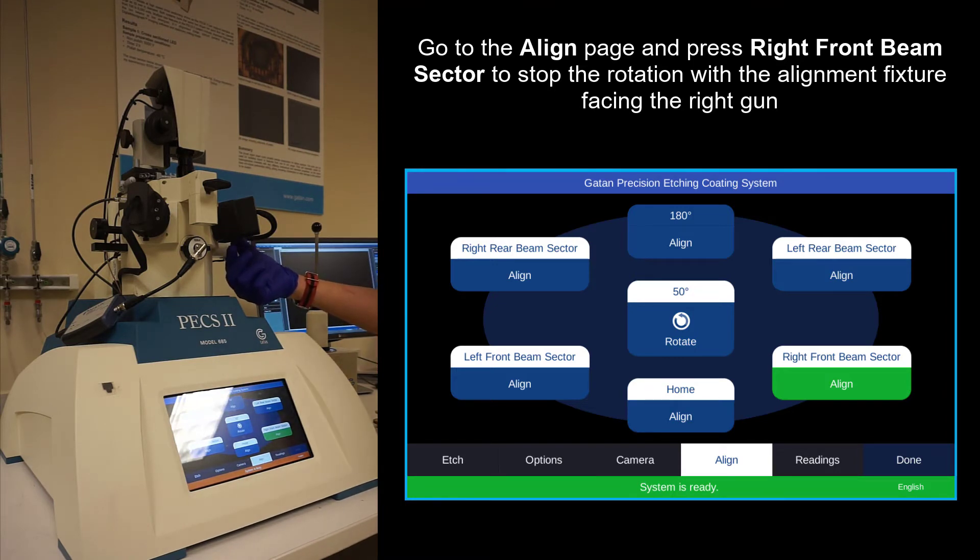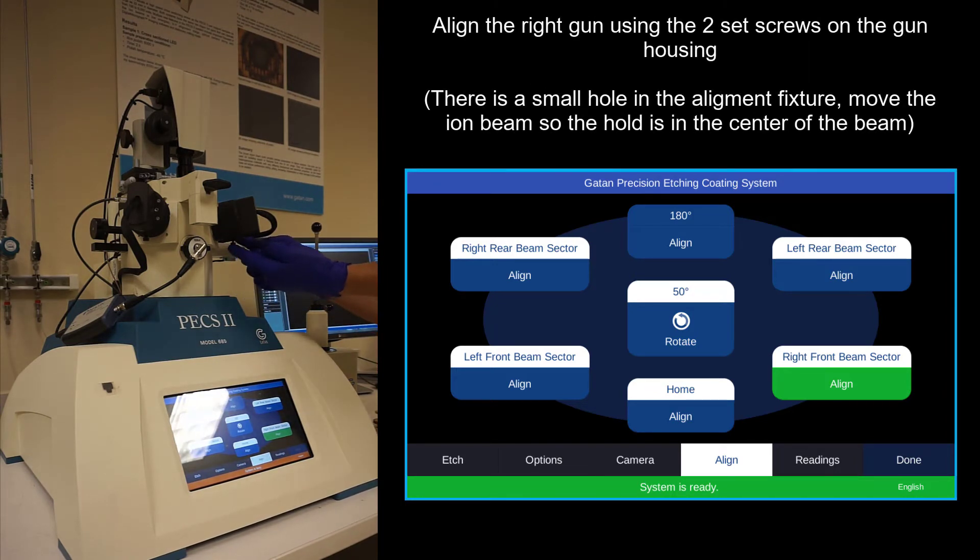And you will align the gun with these two set screws here. This is a vertical, this is a horizontal, and we'll get a picture of that so we can see what a properly aligned gun looks like.